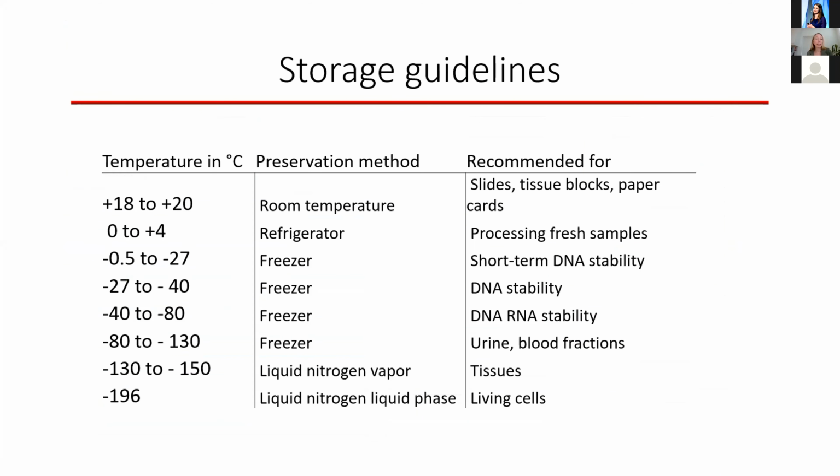Some storage guidelines. Room temperature is used for slides, tissue blocks, and paper cards, whereas refrigerator is mostly for fresh samples in processing.